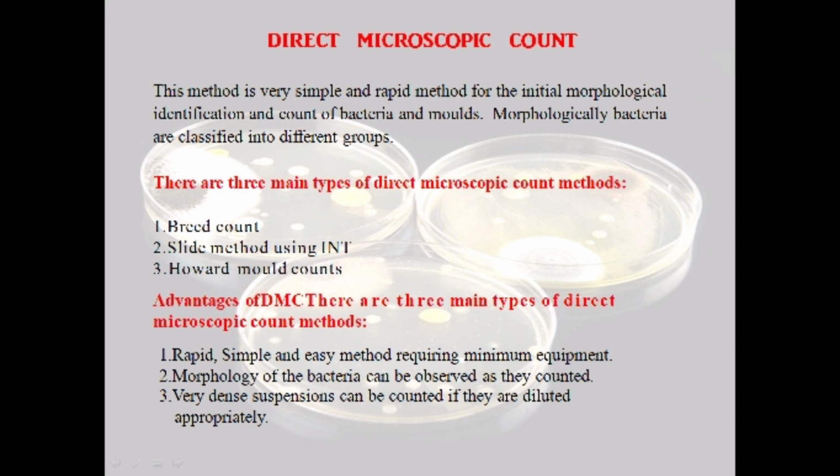The advantages of the DMC method are: number 1, a rapid, simple and easy method requiring minimum equipment. Number 2, morphology of the bacteria can be observed as they are counted. Number 3, very dense suspensions can be counted if they are diluted appropriately.